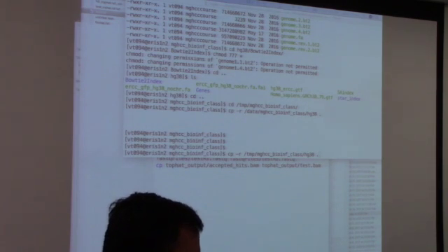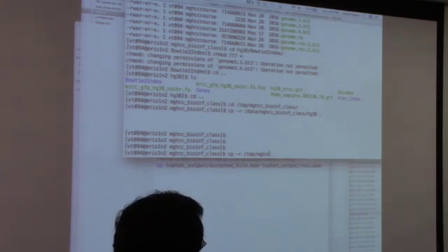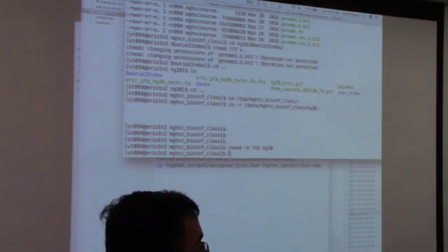It's not? I thought it was. Is it saying permission denied? Yes. Okay. Alright, so let's do something else. chmod -R 755 hg38. Okay, try now. What's the -R do? Recursive, it just changes everything within, because otherwise you'll have to individually change every single file.